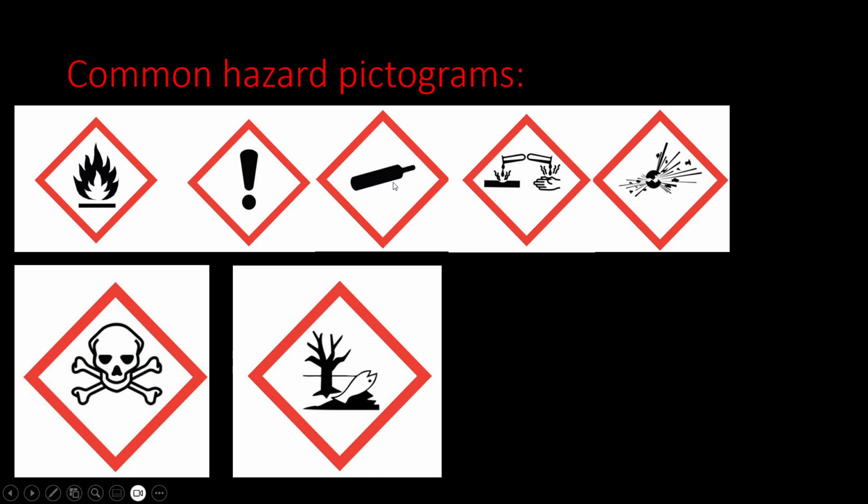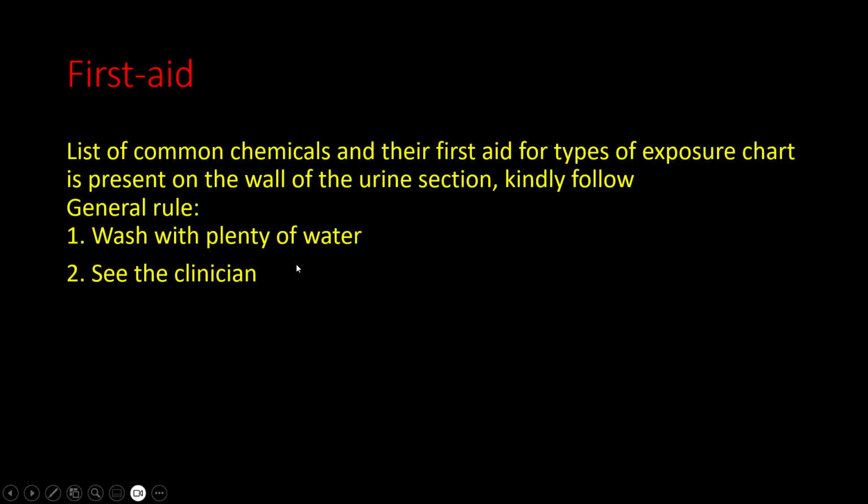Like this there are various such pictograms present. Individually, you have to know at least a few of them, so that you know exactly what type of hazardous material you are going to deal with. Now, how to give first aid when you get exposed to it.